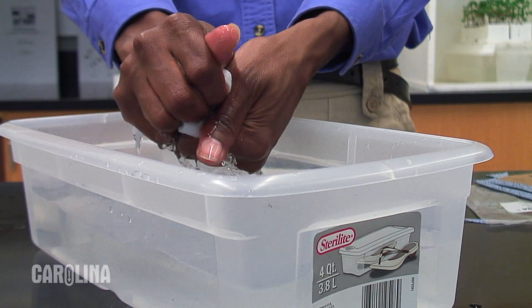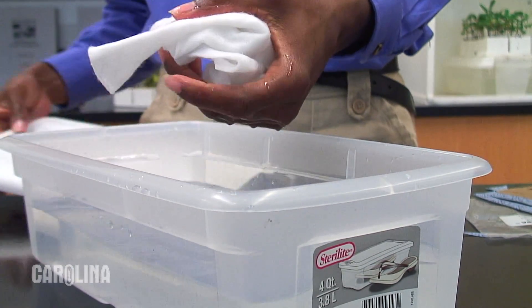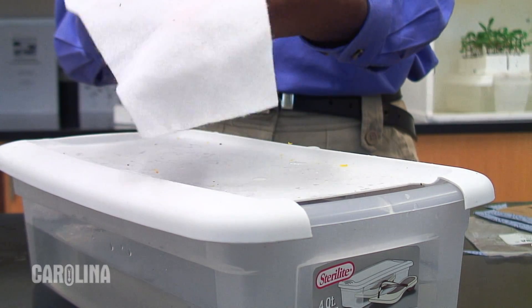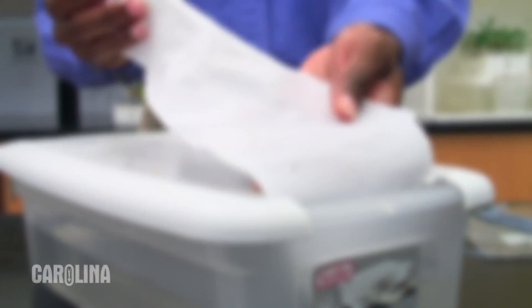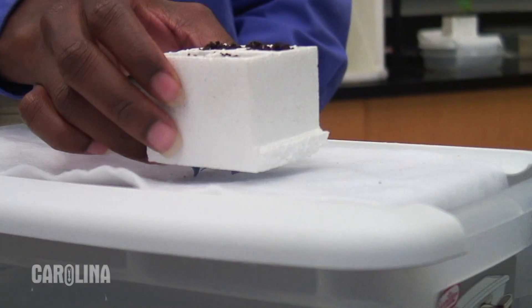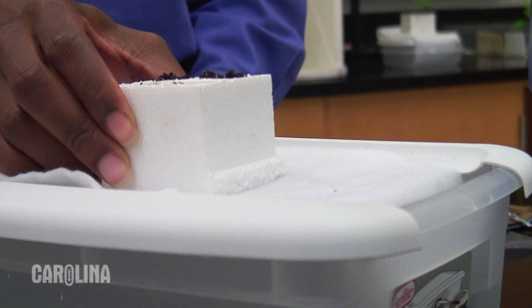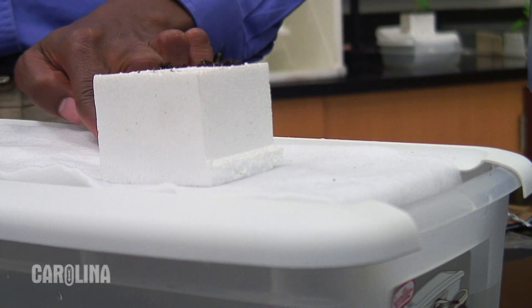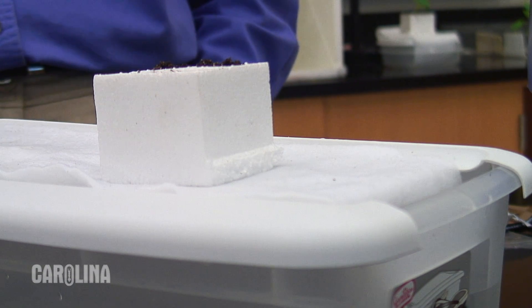Prepare the watering system by saturating a water mat and placing it onto the lid of a tray. The tapered end of the mat should be in the water. Place planted quads firmly onto the mat. The wicks of each quad must contact the mat. The mat absorbs the water from the tray, and the wicks absorb water from the mat and carry it into the potting soil, providing a constant source of water for your fast plants.